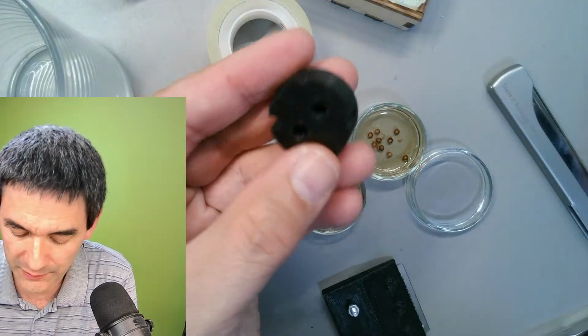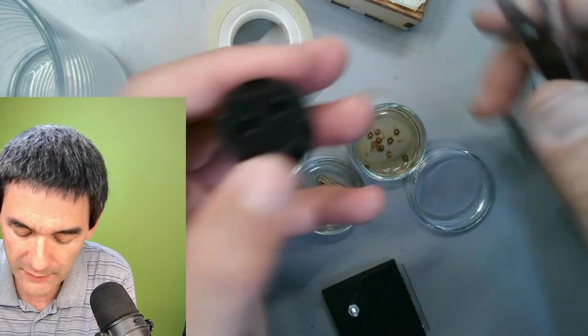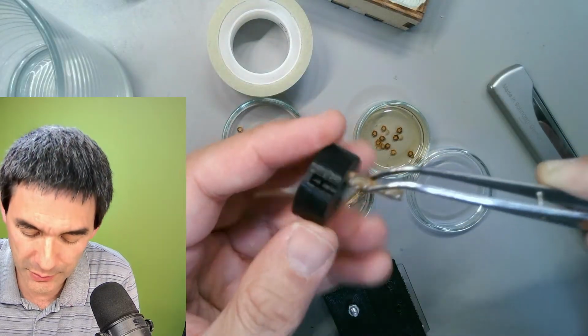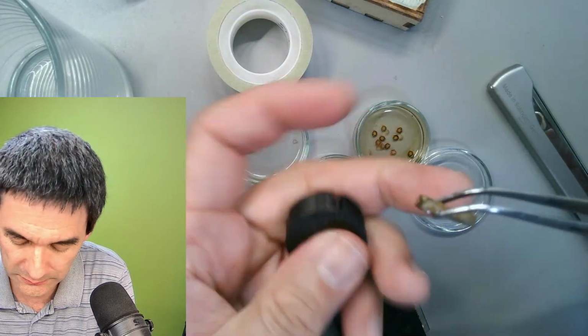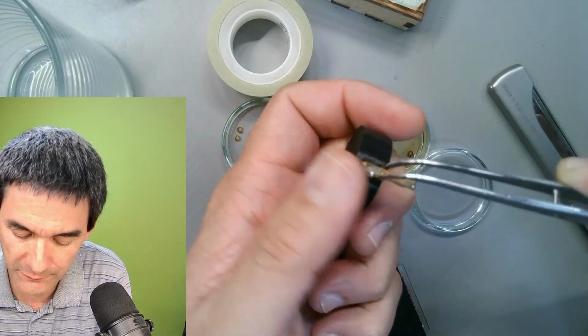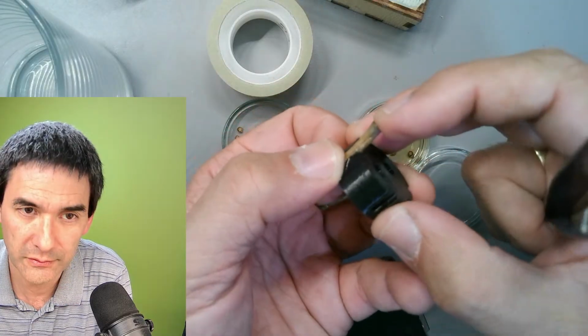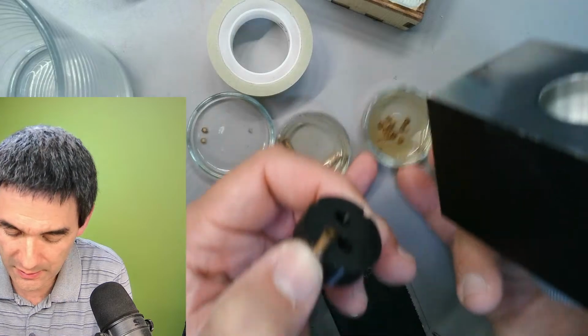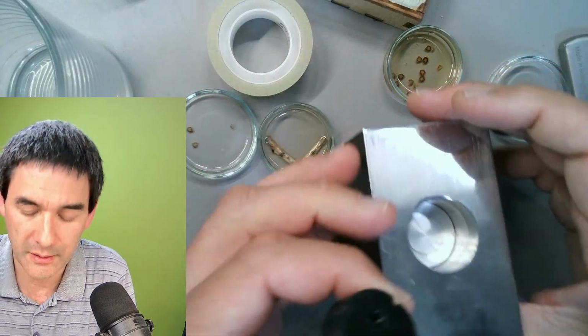I've actually taken one of those here. They basically have different diameters. Like this here on the side, and then I put it in here.